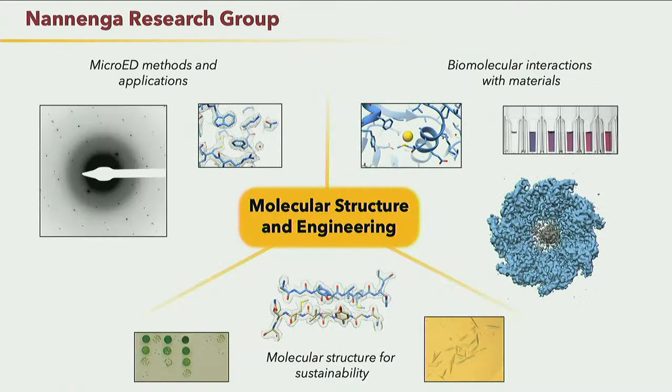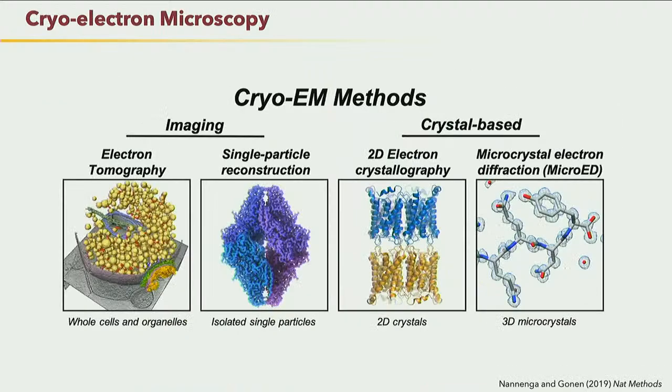As Jose mentioned, in my lab we have a lot of different projects. I'm going to mostly talk about, like I said, the methods and applications for cryo-EM, of which MicroED is one of these methods. And just to orient everybody, you're probably familiar with cryo-EM. It's a very popular technique right now. And when people think of cryo-TEM, they normally think about single particle cryo-TEM, right? That's where you image individual molecules, you average those together, and you solve three-dimensional structures from those images.